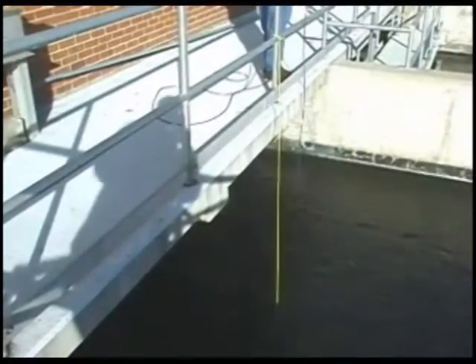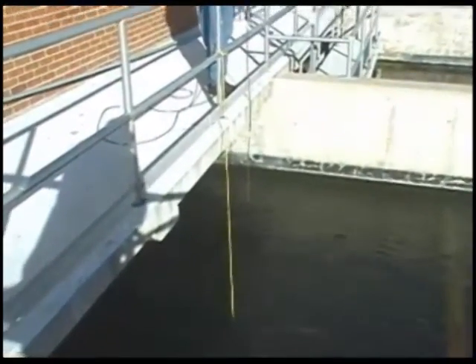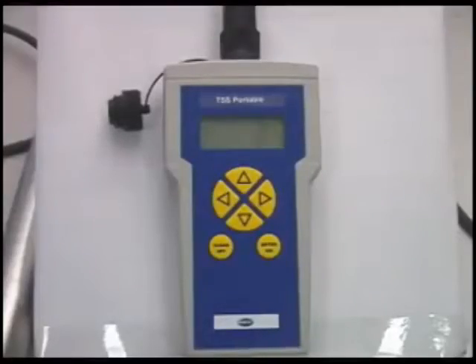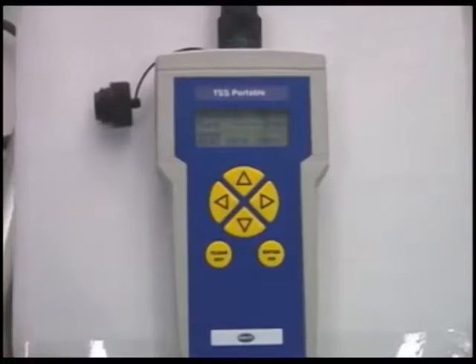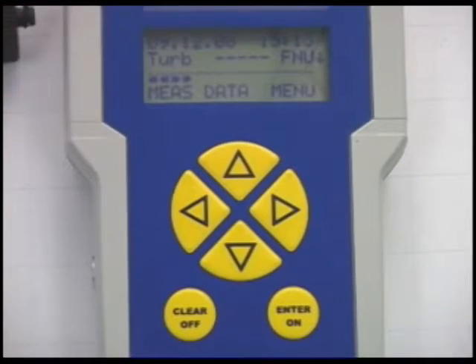No calibration is generally required with turbidity measurements. As a reminder, the instrument comes with a factory default calibration for turbidity that should be perfectly suitable for most applications and measurements. We turn the instrument on, and we first need to make sure that the measurement point that we are going to use is linked with the default calibration curve for turbidity.